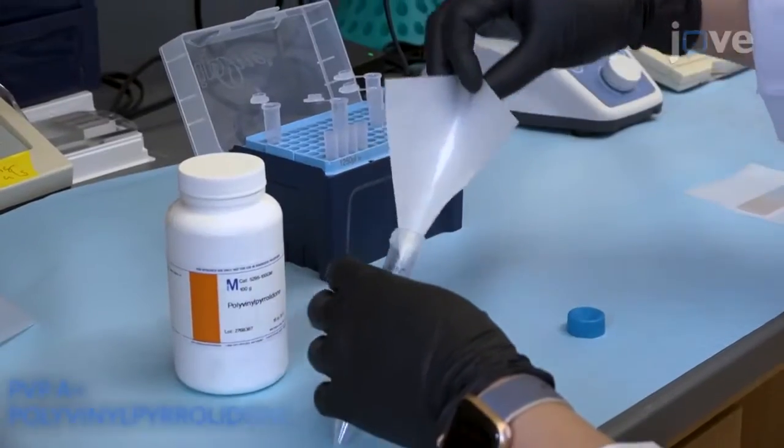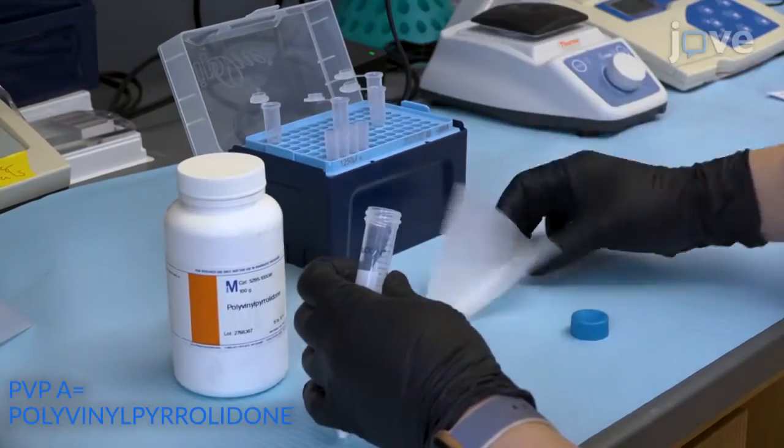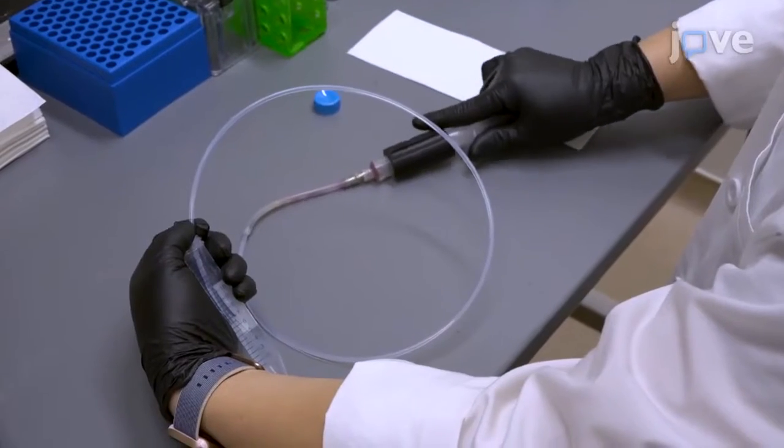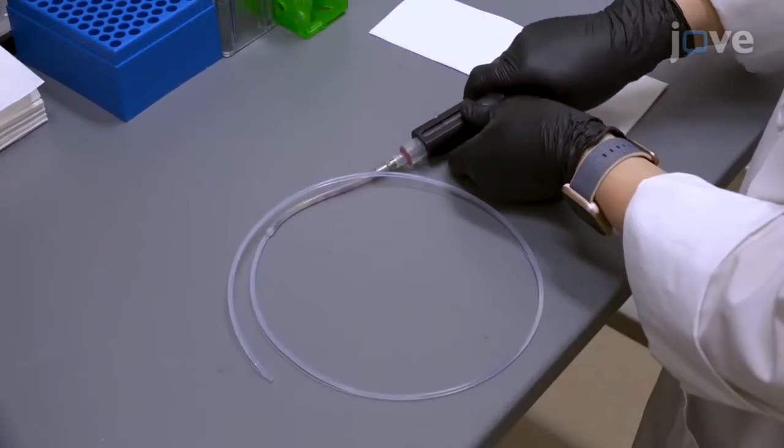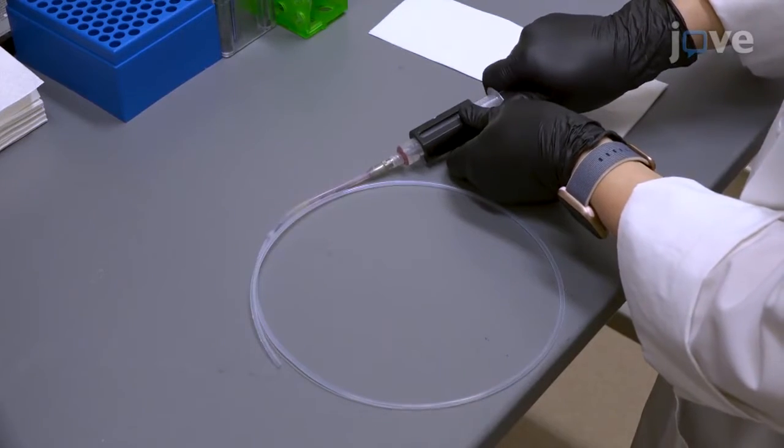Begin by preparing PVP solution according to manuscript directions. Fill the tubing with PVP and leave it for 20 minutes, and expel it through the other end with a 10 milliliter syringe.